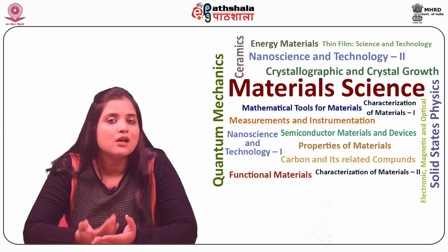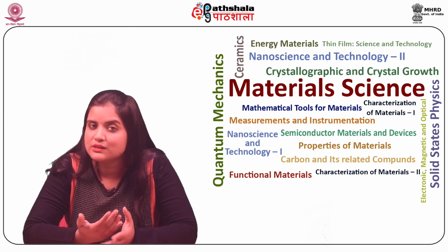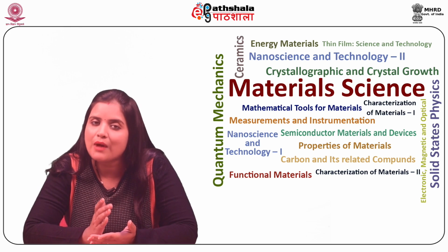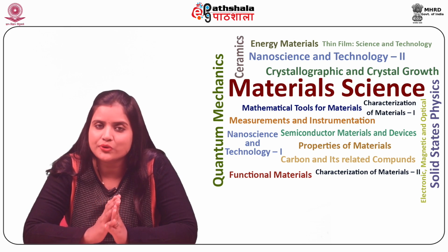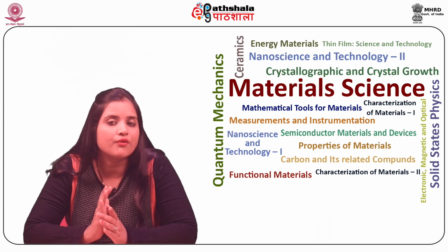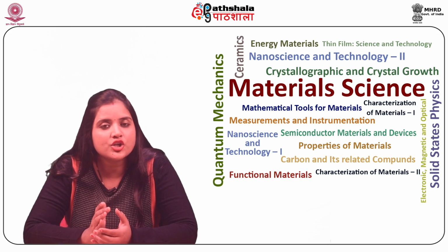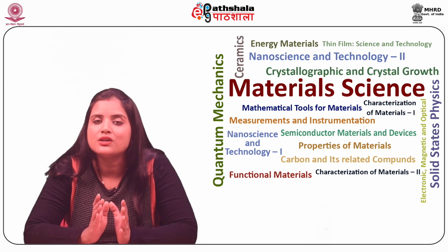Let us discuss digital holographic microscopy, that is DHM. DHM is the digital holography which is used in microscopy. It is different from other microscopy techniques which record the projected images of the object. It records the light wavefront information originating from the object as a hologram in digital form.